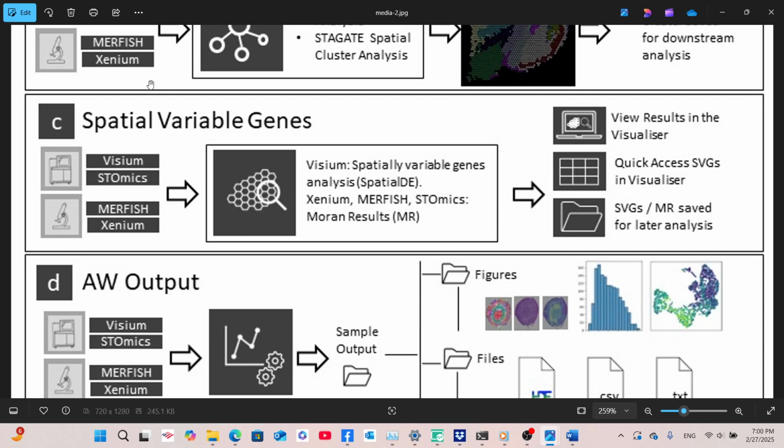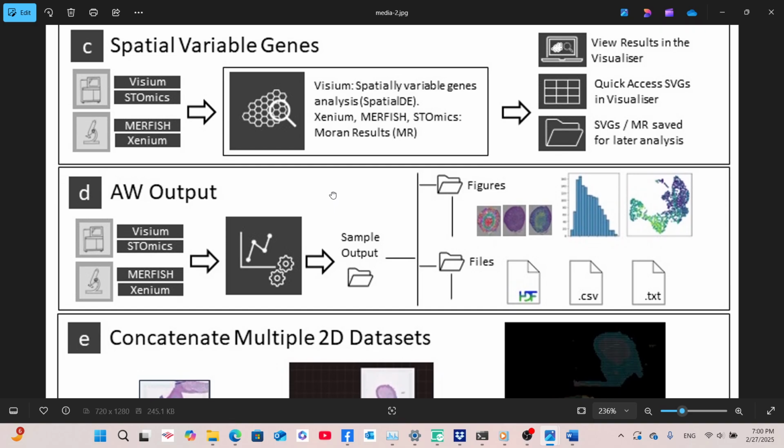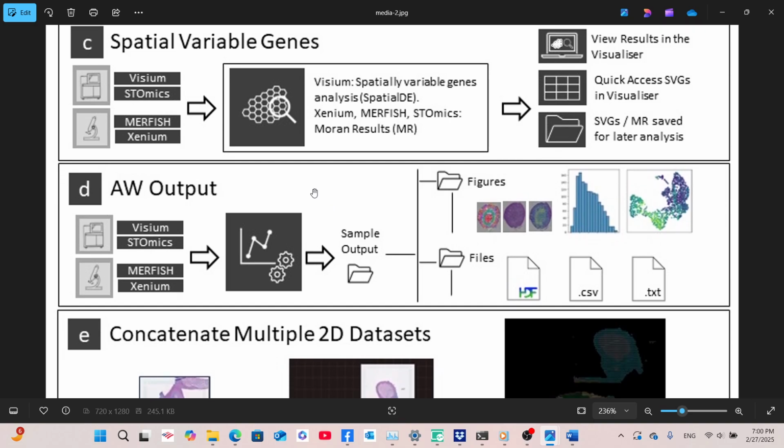Visualizer capabilities. Across these SRT platforms, different terms are used for the smallest individual capture area of each technique, for example, spots, locus/loci, bins, or locations. For consistency, we will henceforth use the term locations, always referring to the smallest individual capture area of the respective SRT methods.